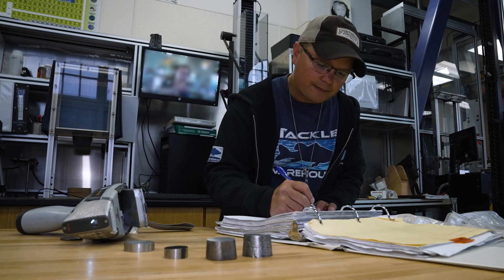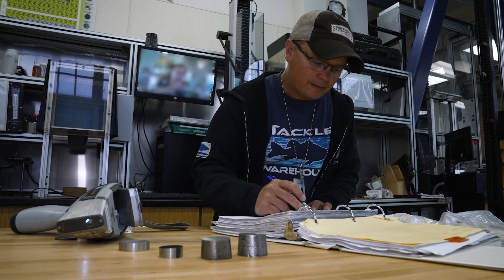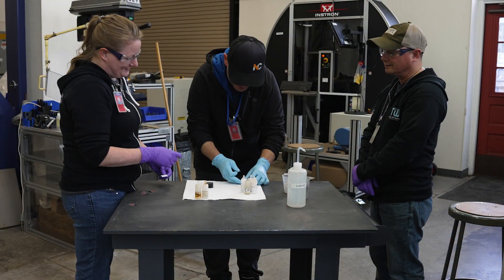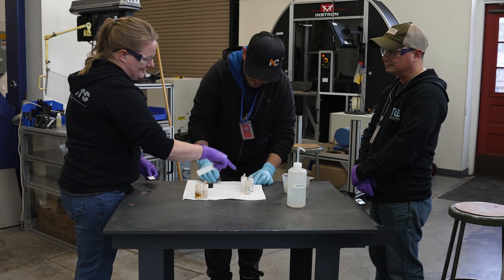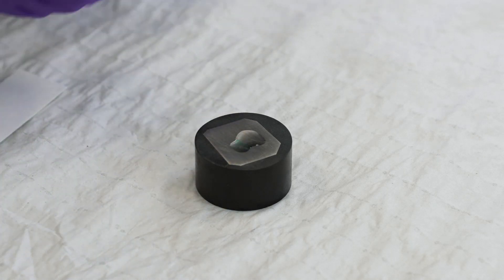The Alloy Identity Program ensures the shipyard is using the correct metal alloys for intended applications. This program also includes training code 133 and 139 inspectors to perform acid spots for verifying material.